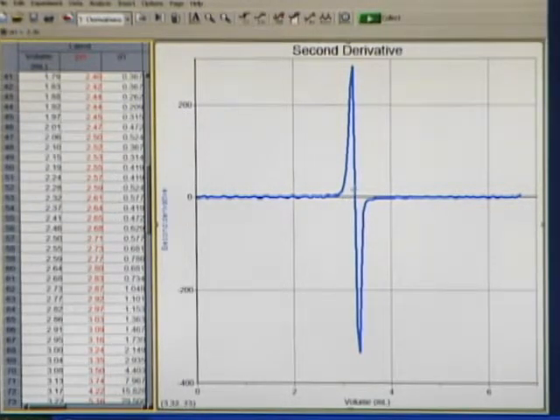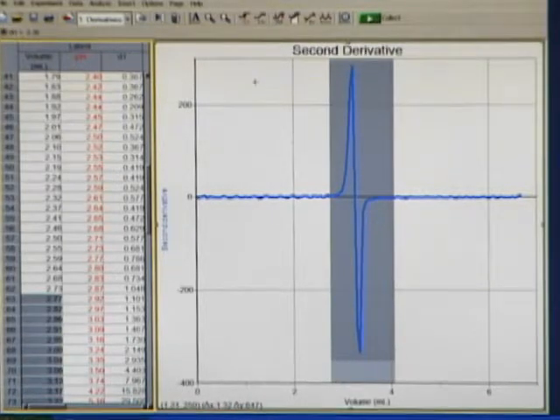And our equivalence point is going to be right where that second derivative crosses the zero line. So to find that point exactly, I'm going to zoom in on this whole area where that action is happening with the zoom key here on the toolbar.